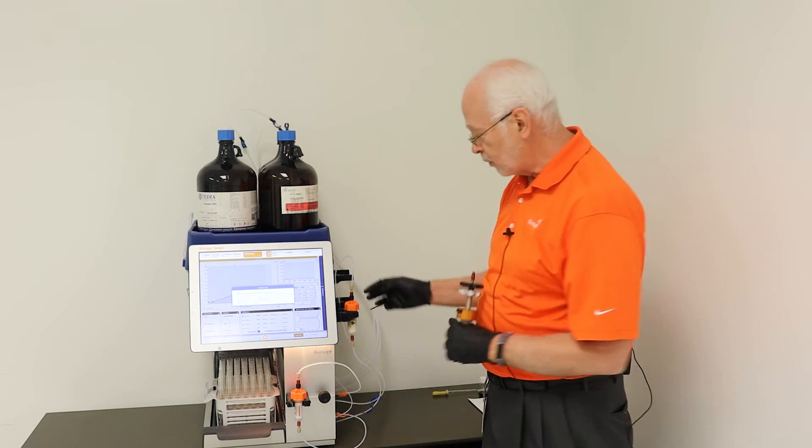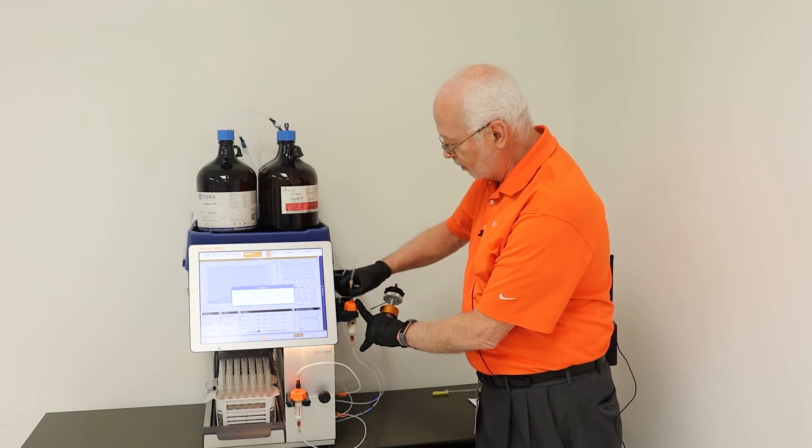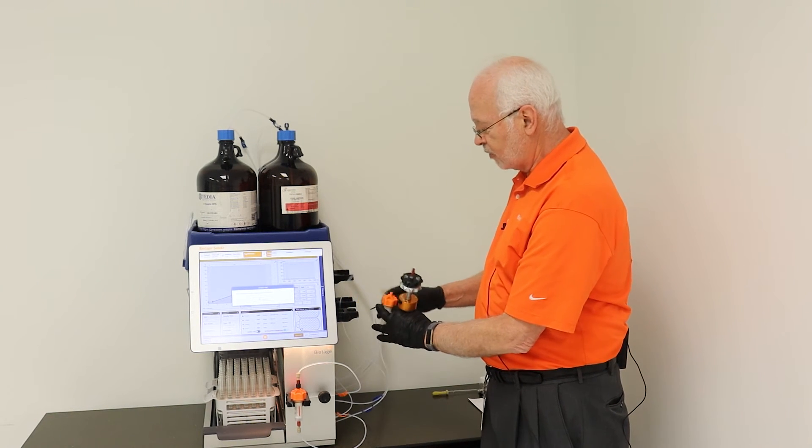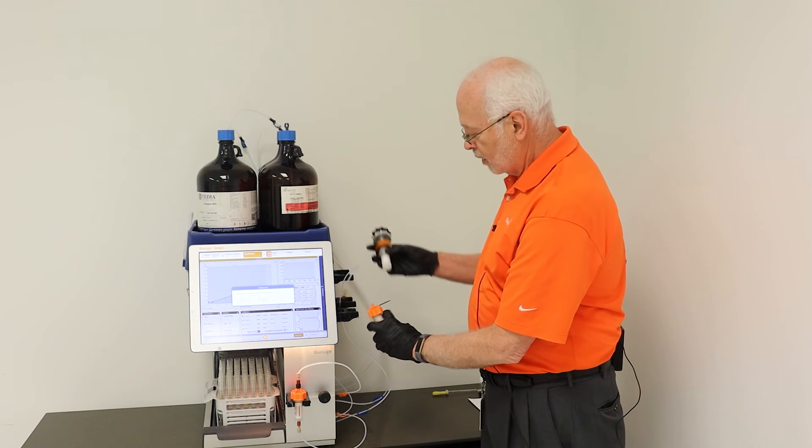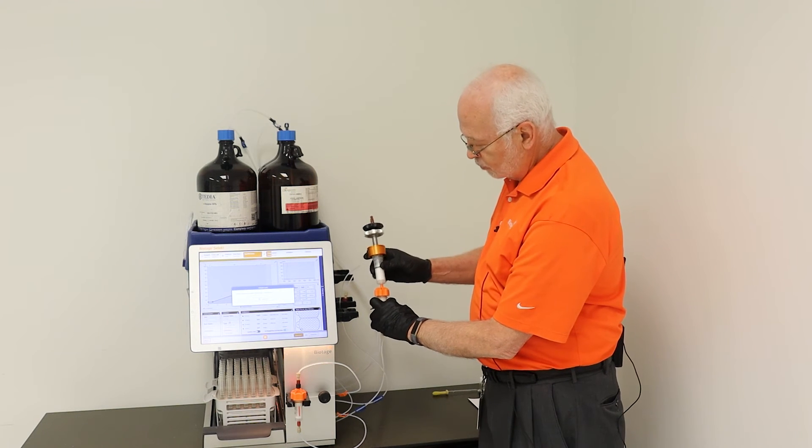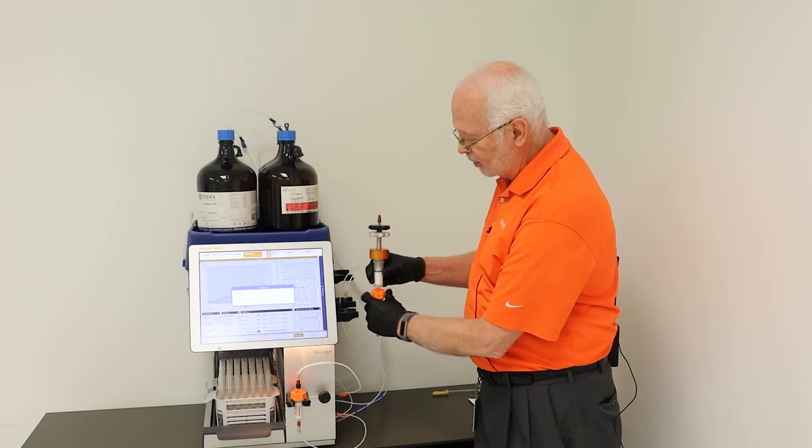So the best way to do that would be to disconnect the inlet tubing from your primary purification column. Then attach your dry load vessel to the top of that column.